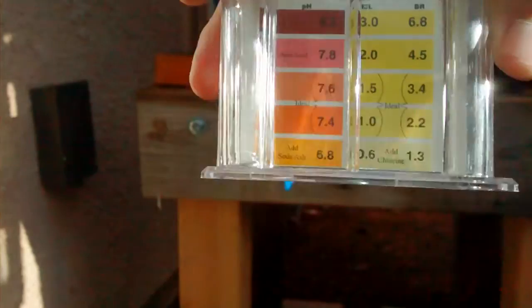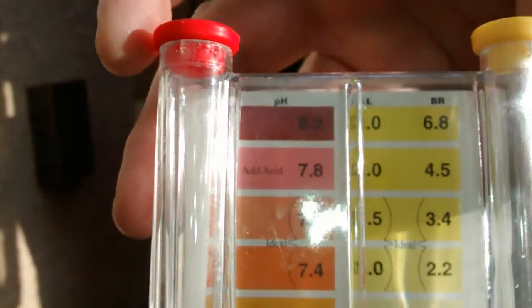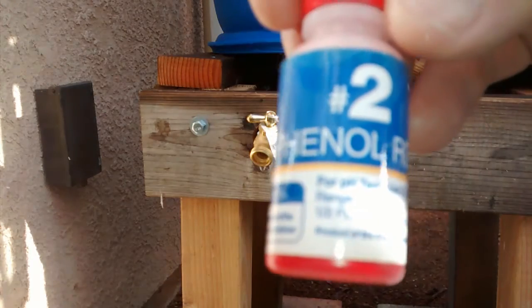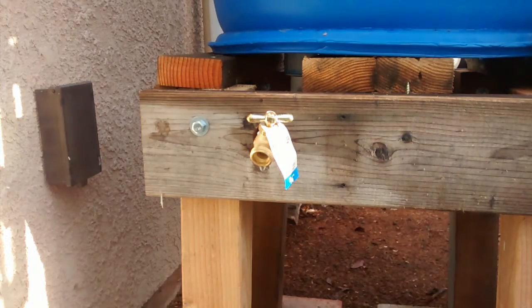So basically I'm going to be filling this up to about right here where my finger is, right there. And I'm going to be adding five drops of this solution. So let's go ahead and fill this water up.